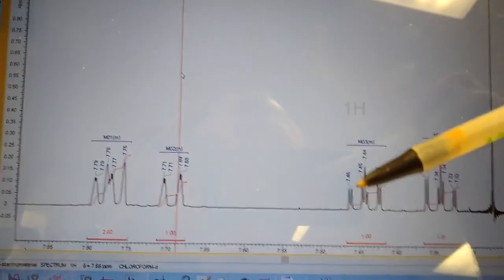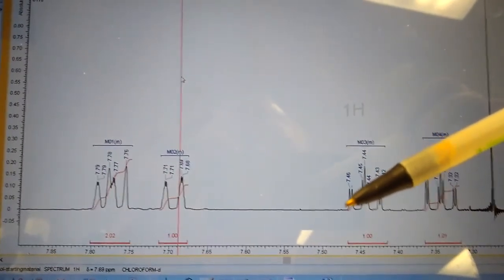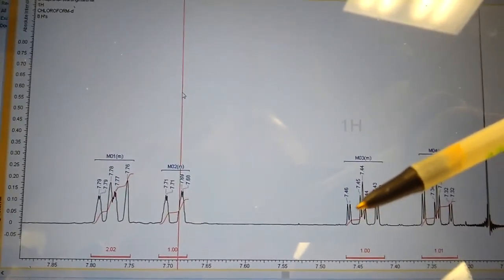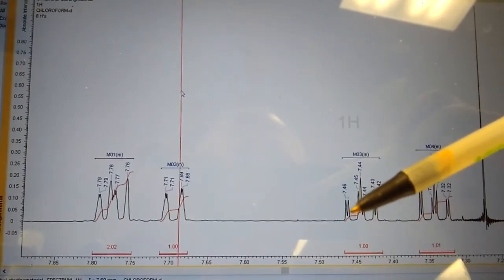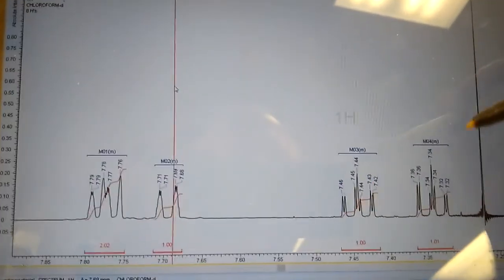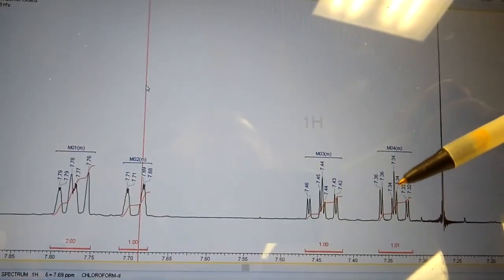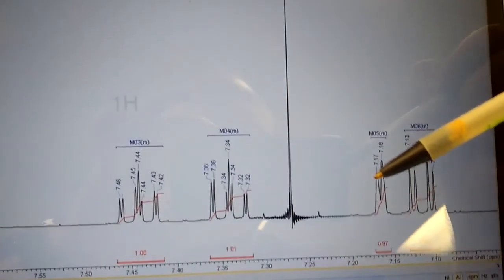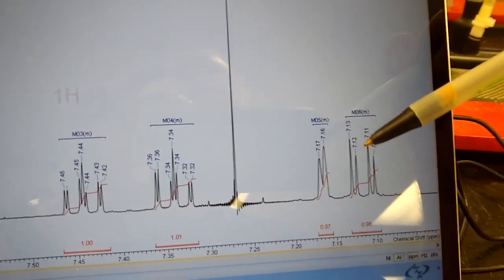Over here we're going to call that a one H triplet. It gets more complicated than just saying doublet, triplet, but for this class you would just call that a triplet where it's equal distance from here to here and then equal distance from this middle one to that one. And that would also be a one H triplet, one H, equal distance here and then same to here. That would be a doublet.